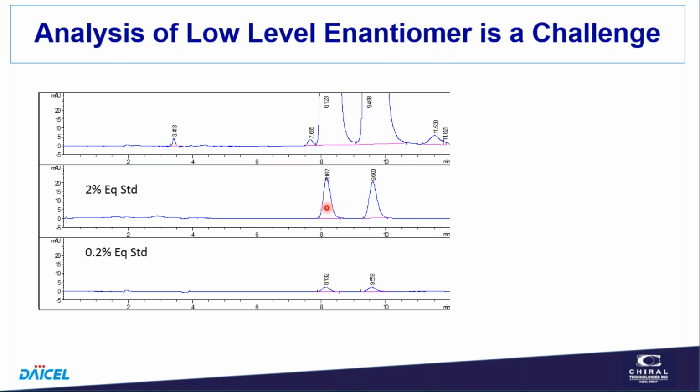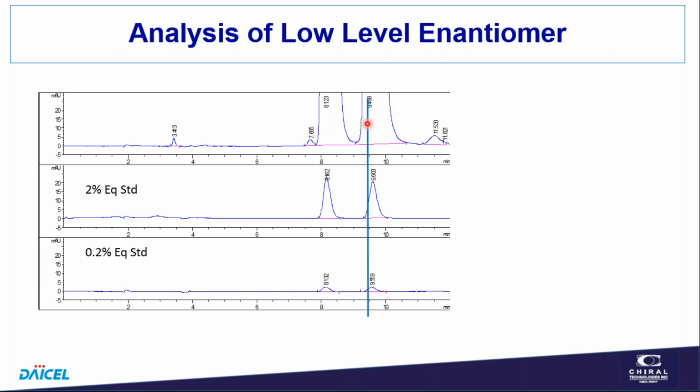The peaks get smaller, and there's not quite as much tailing. Peak width's a little sharper just because of the column overload problem. So it's not a problem, but at low-level components, think about what happens as we bleed some of this isomer into this more retained peak.